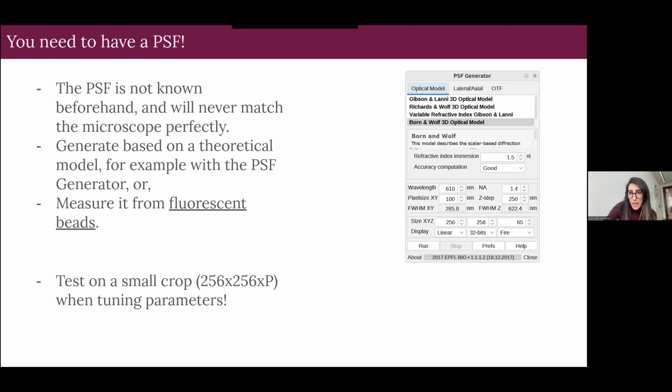So you can just use the default. It should be okay in most cases. And if you for some reason want to increase it, then you can do it. But you should be able to get good images with this in most cases. The default is set high, so actually, if you know what you're doing, you can probably use a lower number. It will be a little quicker, but it doesn't matter much.